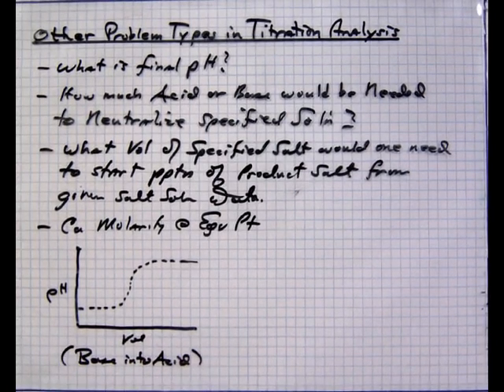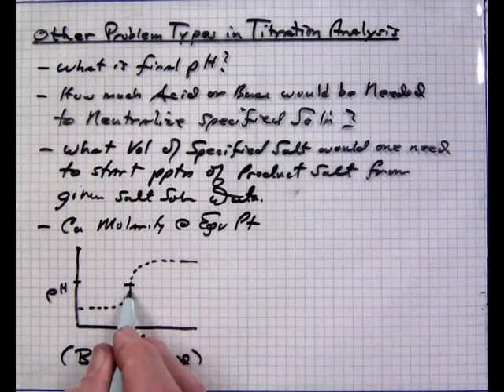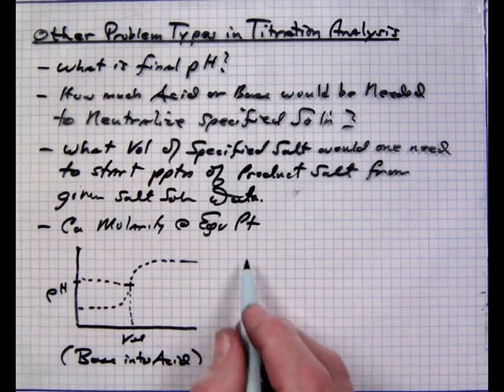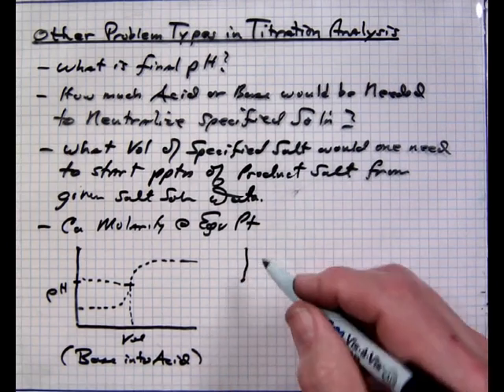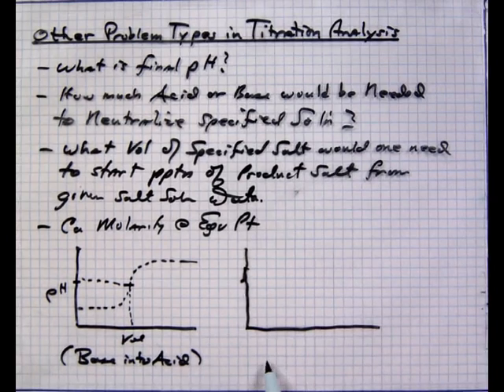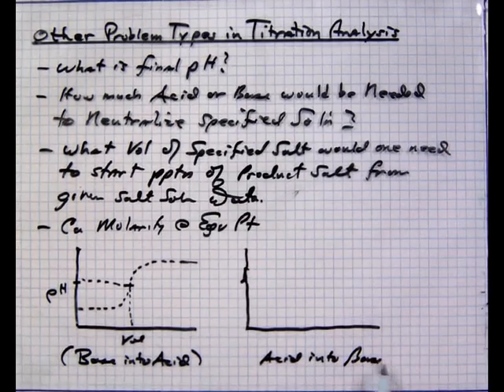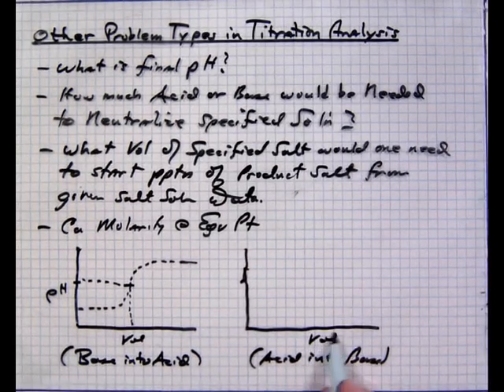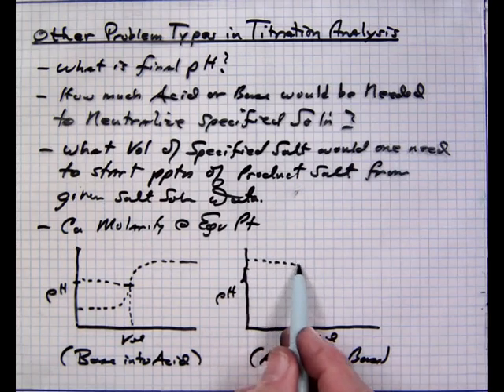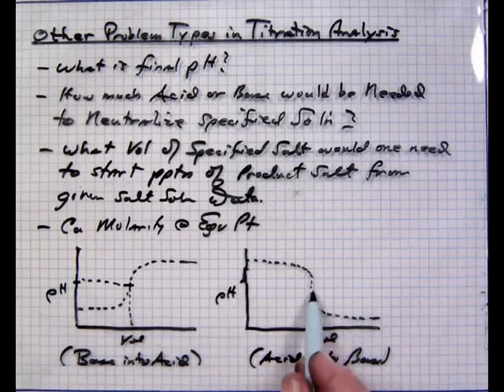And if it's a strong titration, of course your equivalence point pH would still be at this position right there. And as we've shown in the example we used, if we have acid into base, we would probably be monitoring what's in the beaker, and it would follow that trend.